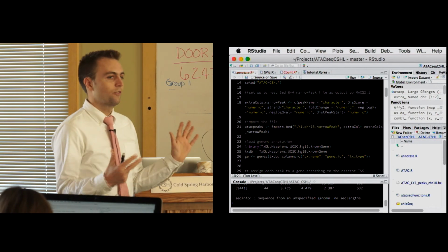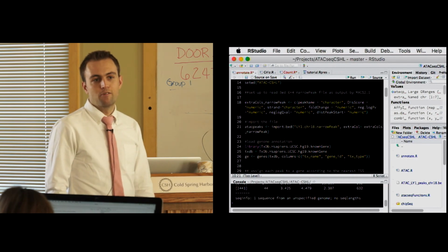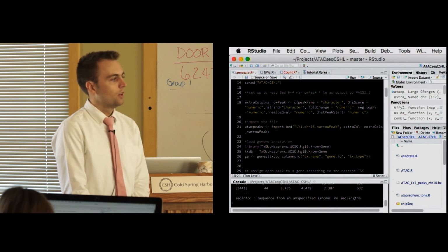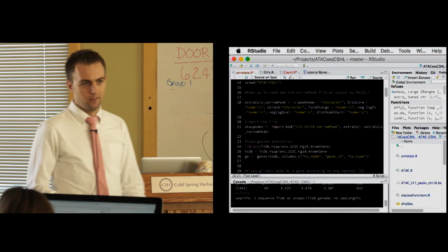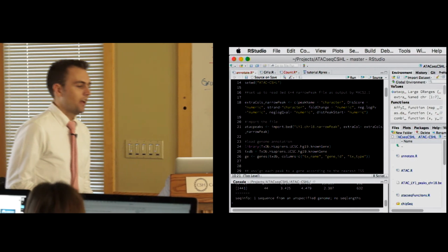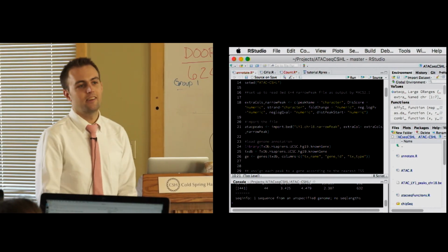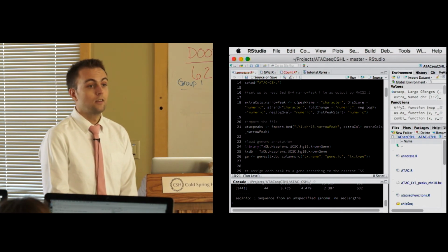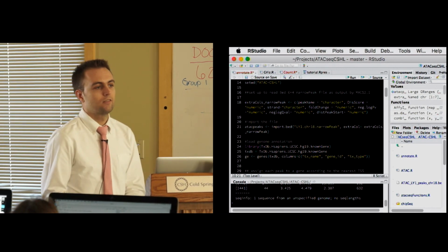There are a number of ways we can do that, but we're going to need genome information, right? Based on the coordinates, where's our nearest gene? But thinking about that, what are the implications of doing that? Let's say for every region of open chromatin, we say that's the gene it's associated with. You could have multiple genes associated with different regions, or the same region. Yeah, right, one gene can have lots of peaks nearby.